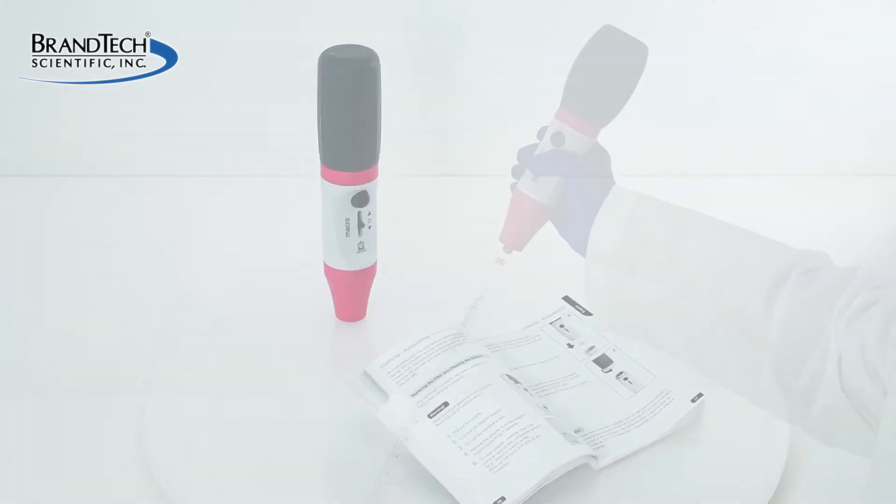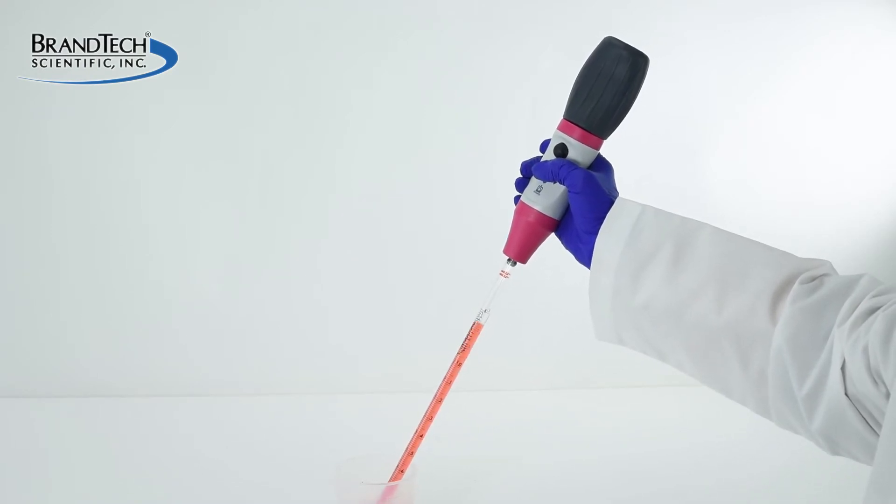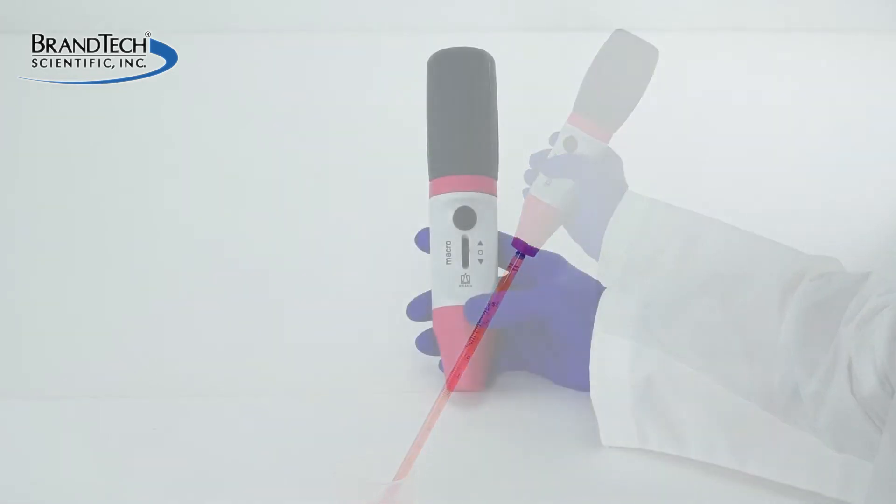Filters need to be changed for several different reasons, such as wetting the filter due to over-aspiration of liquids, after repeated autoclaving, or simply after prolonged use.